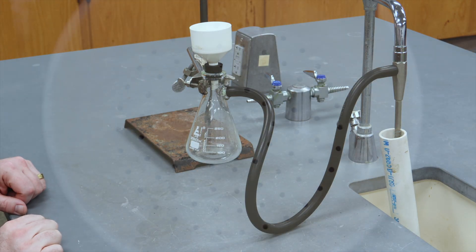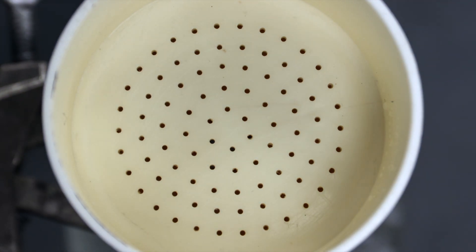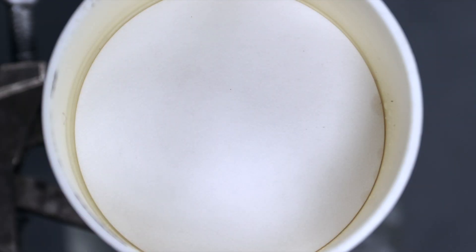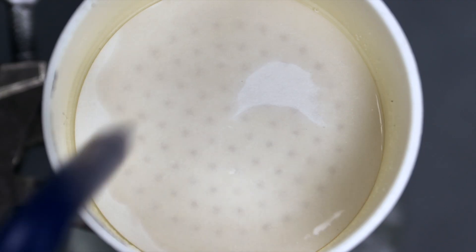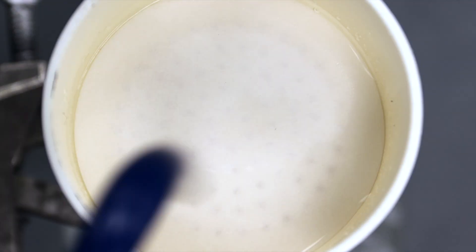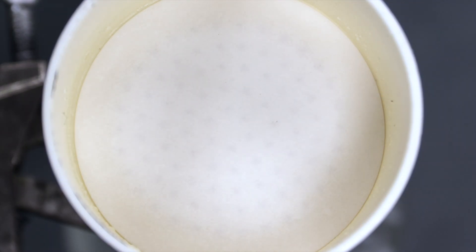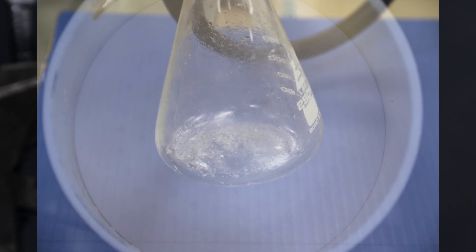Once you've got your filter paper in the Buechner funnel, you'll need to turn the vacuum on and make sure the filter paper is covering the holes and is held securely in place by the suction. I recommend using a bit of solvent to wet your filter paper and then applying the vacuum to hold the filter paper in place. In this case, the solvent is water, but you might have a different solvent, so check your procedure.